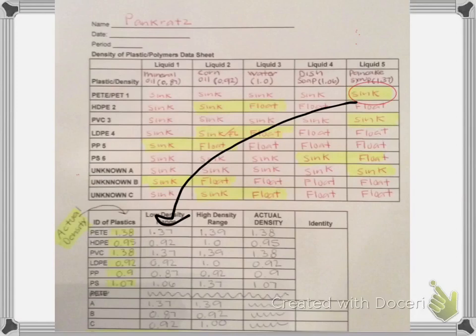Now on the sheet I gave you guys in your baskets, or on your green sheet, you were supposed to look up the actual density of PET. So you see right here that I've done it here, and it's also over here as well.